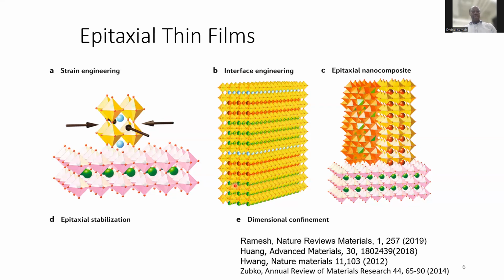The other reason why we grow these materials as thin films is that we can form interfaces. So we can grow materials with different compositions and different properties and make stacks of them. And at these interfaces, in many, many cases, effects which are not found in the material sitting off the shelf can be produced. For example, some of these interfaces between materials which might be insulating by themselves, we can make materials which are superconducting and materials which are magnetic. Right, so the ability to make materials and grow them as really thin atomic layers allows us to use this approach of interface engineering to produce new interesting effects.